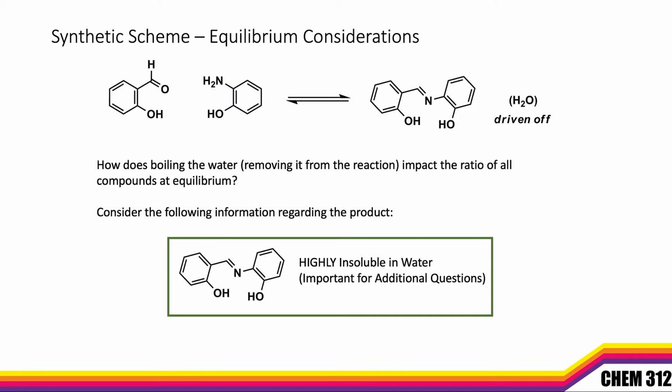And the second thing to think about is it turns out this imine product is actually highly insoluble in water. So these two bits of information are important when we think about how equilibrium is going to affect our synthesis. And so with that, let's go ahead and see how we make this imine.